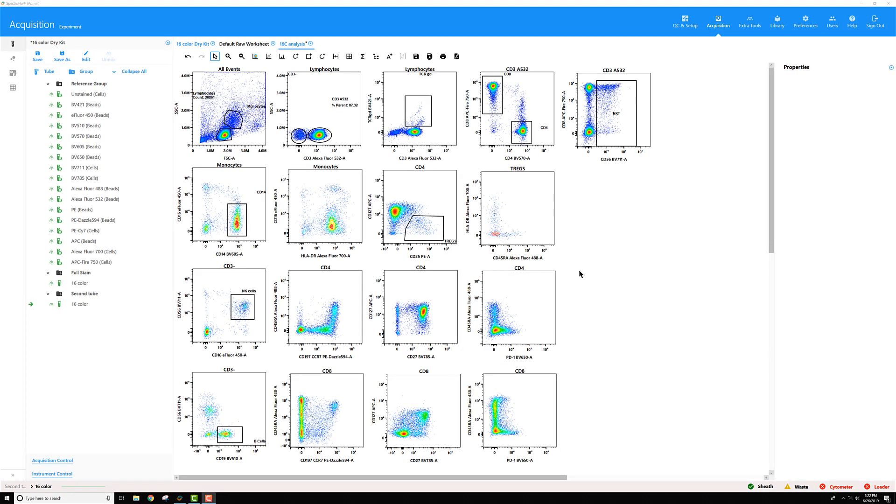In SpectraFlow version 2.1, there's a feature that allows you to export data through one of the gates on your worksheets and save only the gated events as an FCS file.